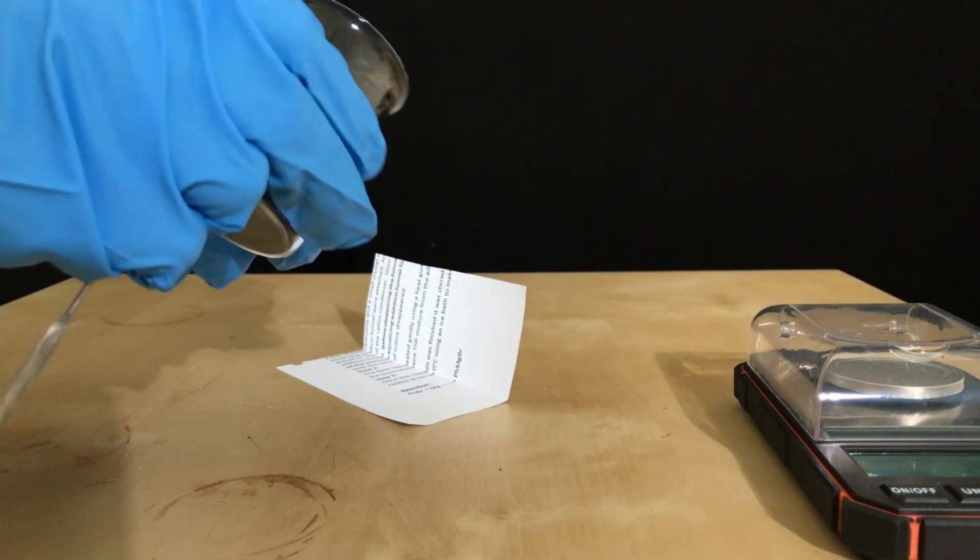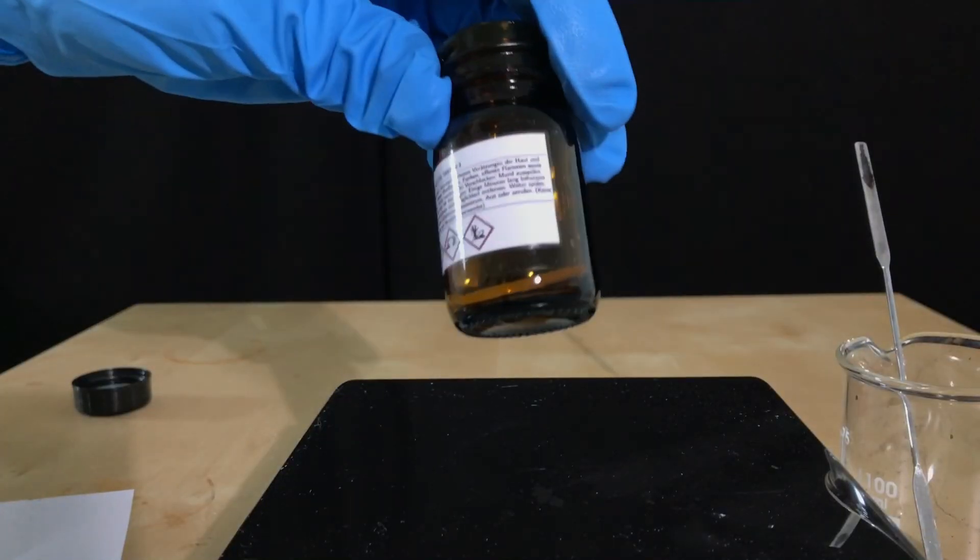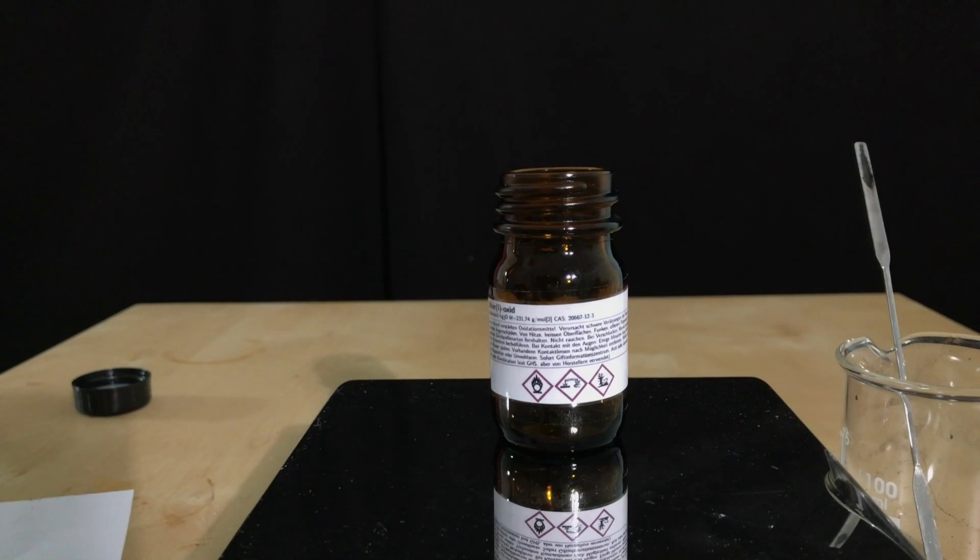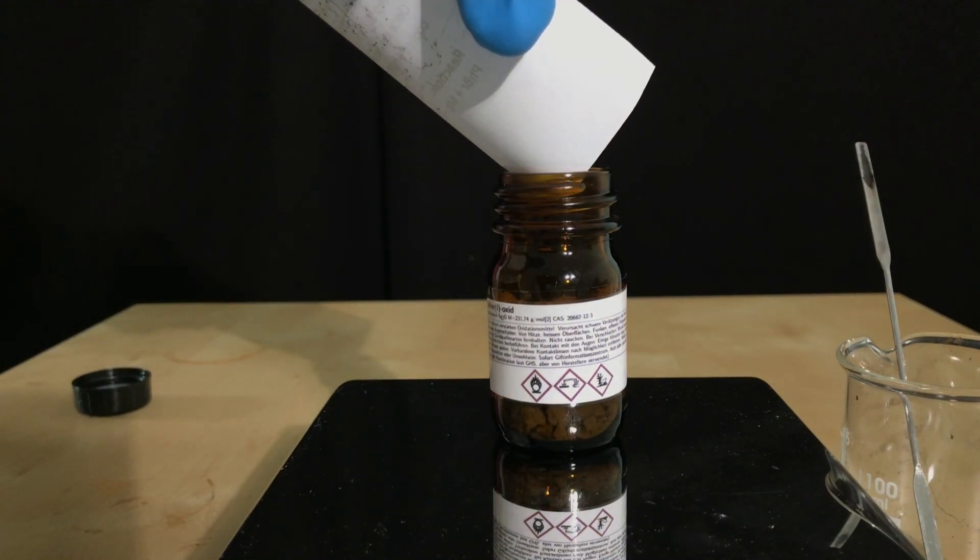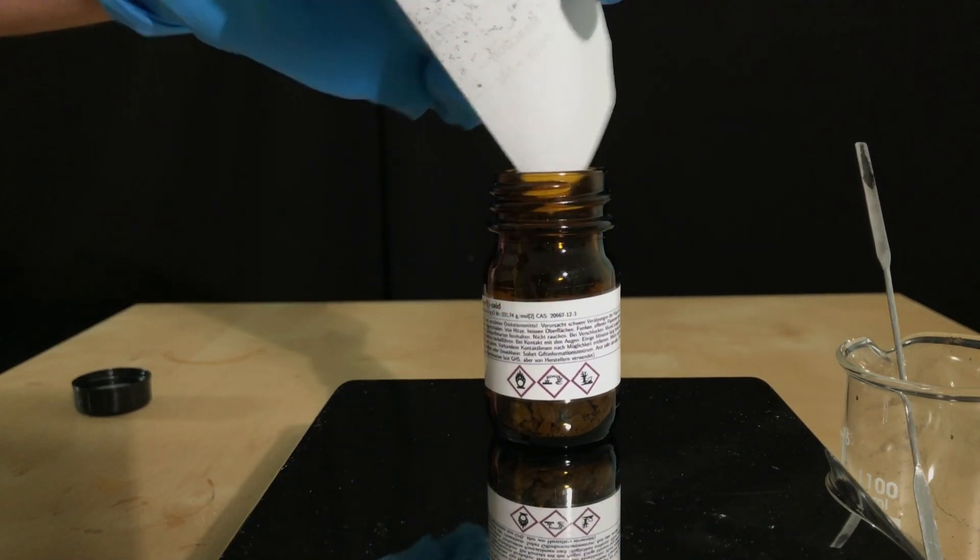Once the big chunks were broken up, they were transferred to a piece of paper to take a few nice pictures. As a storage container I'm using this good looking glass bottle. It was placed on a scale and the scale was set to zero. As it turns out I couldn't use my small scale, because the container is too heavy. Therefore I had to use this other scale and we ended up with 6.7 grams of silver(I) oxide. This corresponds to a yield of about 98.2%.